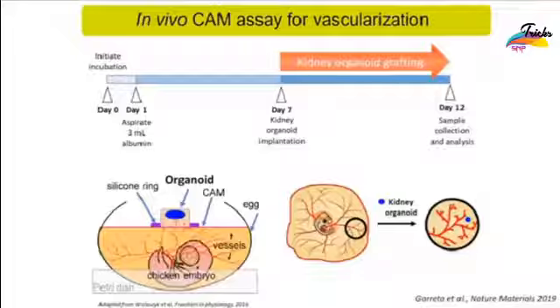So, in order to further solve this question and to explore a new way of providing a vascular environment to our kidney organoids, we made use of the chick chorioallantoic membrane assay. The chick chorioallantoic membrane assay is a highly vascularized extraembryonic tissue that has been extensively used for tumor angiogenesis research and also for grafting biomaterials. Unlike in vivo models such as the mouse, it can represent a natural immunodeficient environment that can offer direct and minimally invasive access to the assay site.